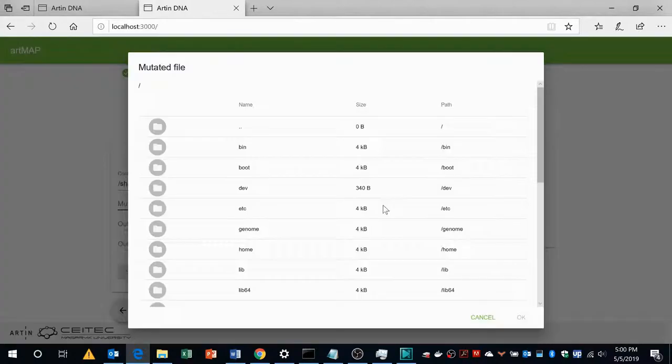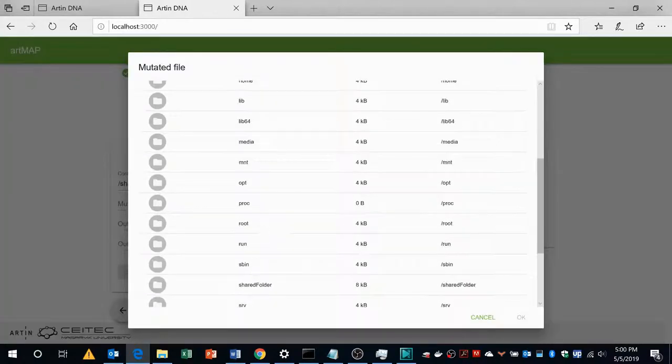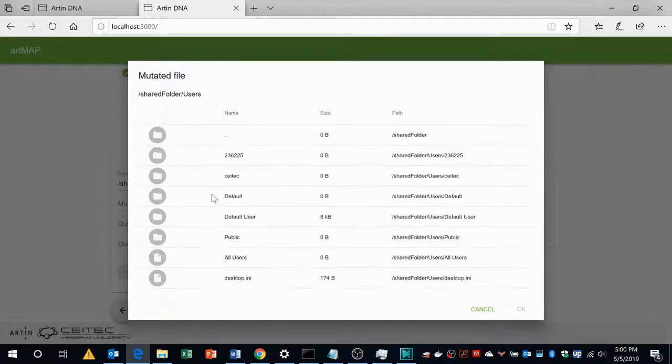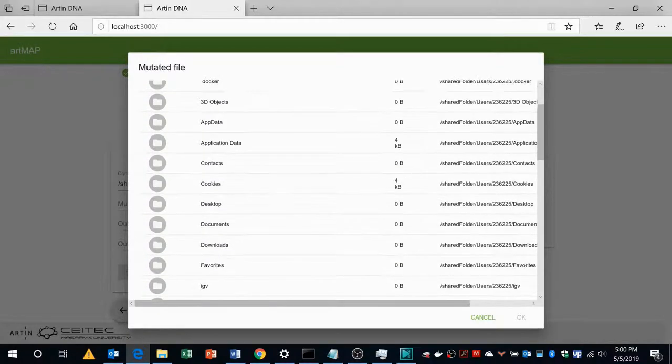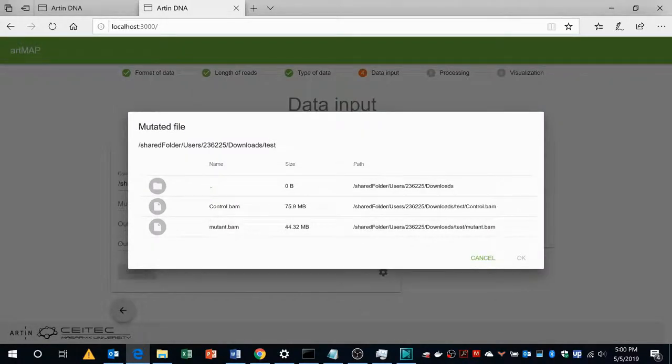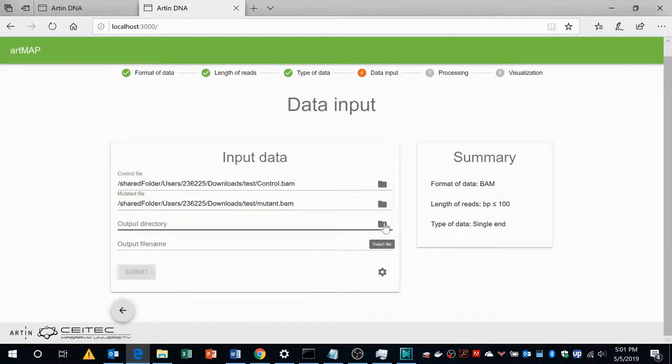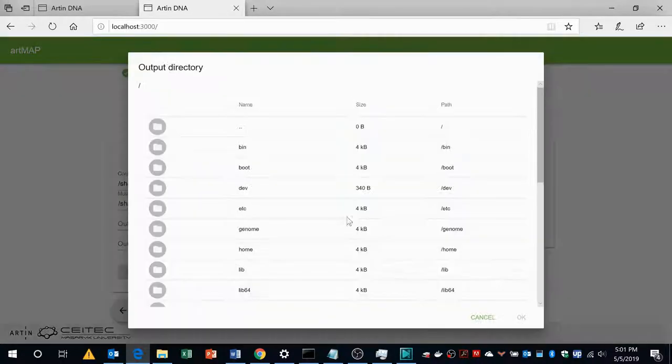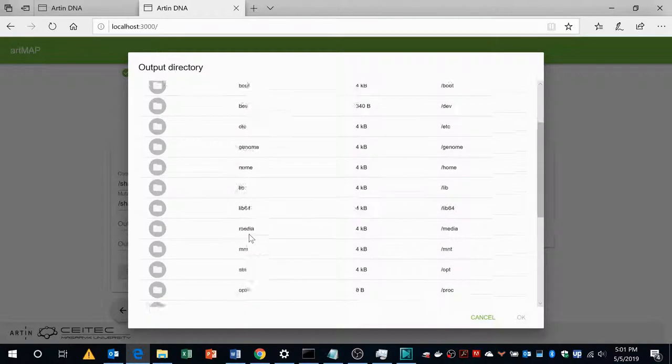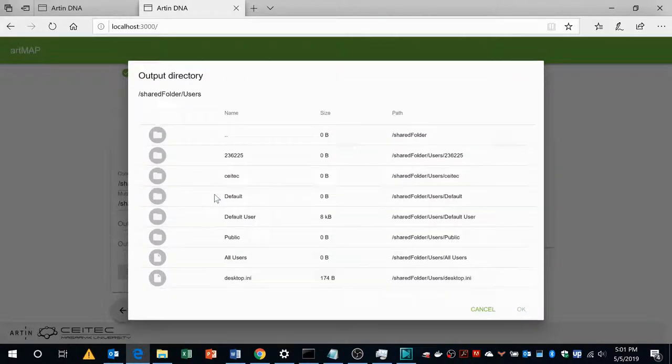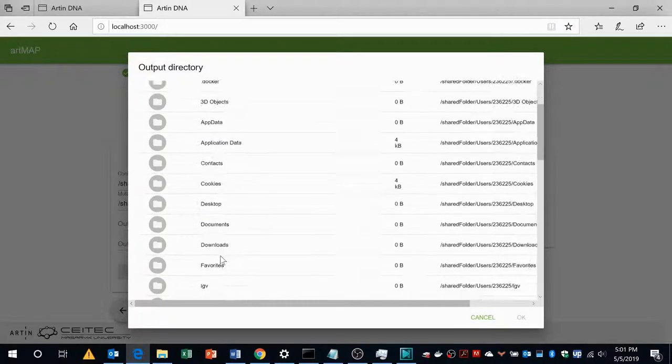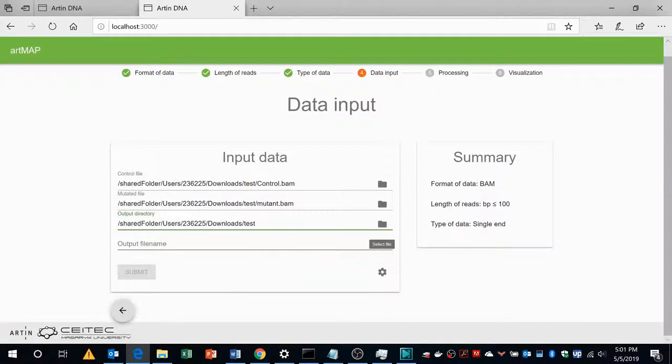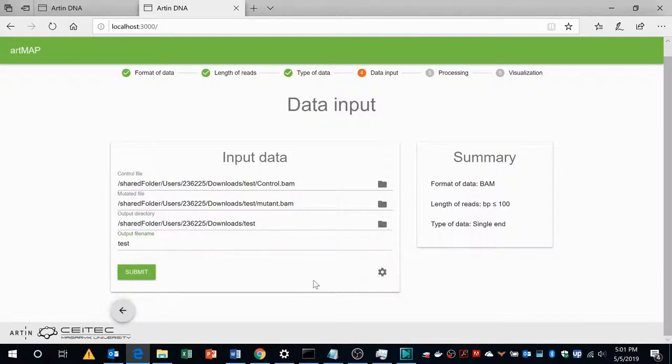For the mutant file we will do the same. Go to the shared folder, users, username, downloads, test, mutant OK. Where do you want to store? We want to store in the same folder. We will go to shared folder, user, username, downloads, test OK and I would like to name it as test file. I will say test.